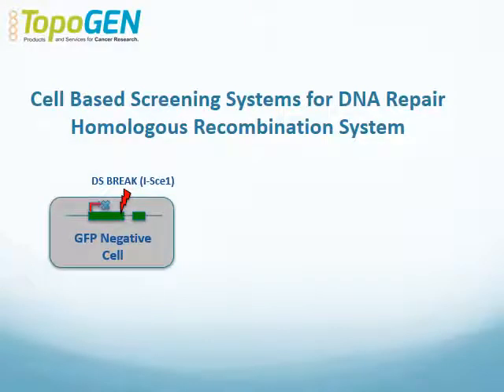The overview of this entire system for both HR and NHEJ involves starting with an engineered cell that's GFP negative but still has the GFP reporter, and this particular gene is inactivated usually through a mutation. So the cell is negative for the fluorochrome. And what happens is we introduce a double-strand break, and this shows an example of using a homing endonuclease called I-SceI, but you can use any system for making the break, as long as the break is introduced in a very specific way. Now, these particular cells are engineered with reporters that will break specifically within the GFP locus.